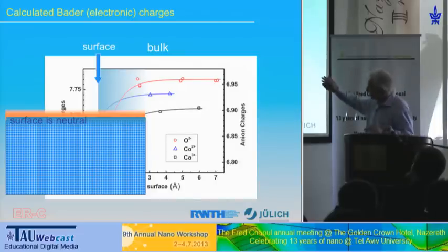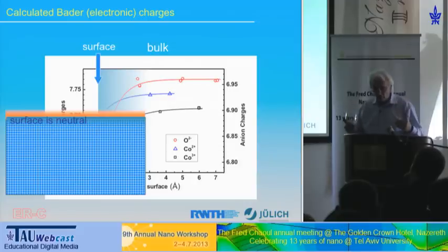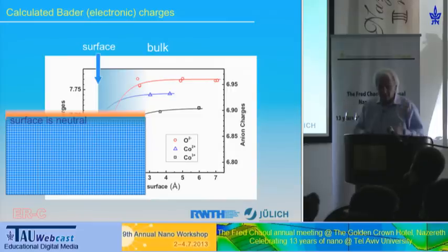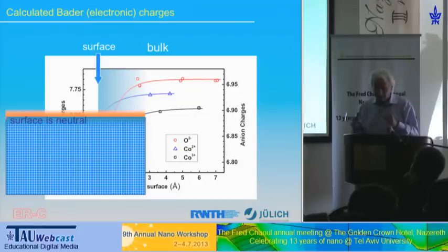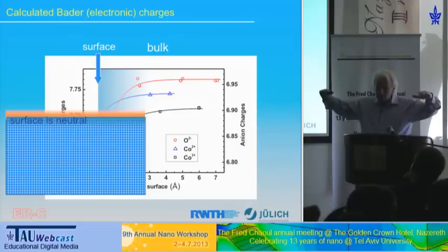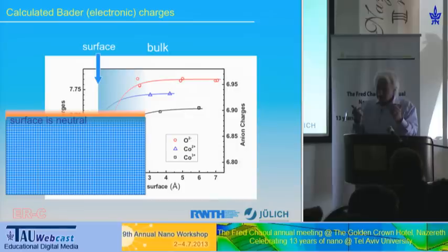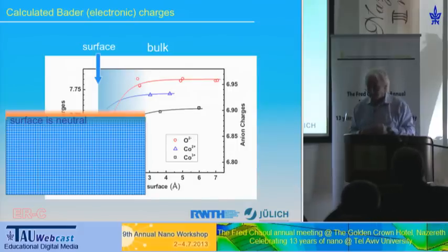And I have put this work at the end of this talk because it shows the tendency today that the groups working optically in the picometer dimensions combine their work with DFT calculations. That means these two techniques are meeting now in dimensions where the physics happens. So these picometer dimensions is where the physics happens. And I think this demonstrates that electron microscopy has emancipated from a structure-oriented tool to a high-precision physical measurement instrument. Thank you.